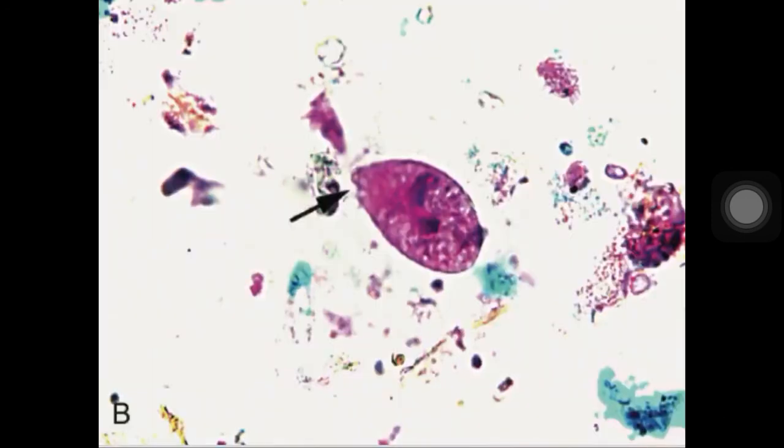Okay, let's now move to your ciliata. Okay, for your ciliates naman po. So, number 21. Okay, ito po siya. Familiar po ba? Okay. Tingnan po natin kung tama yung sagot.